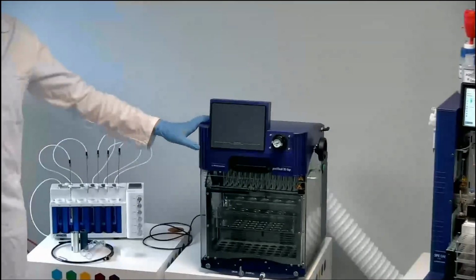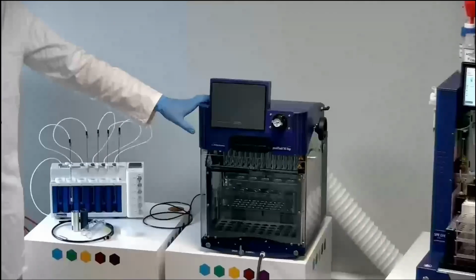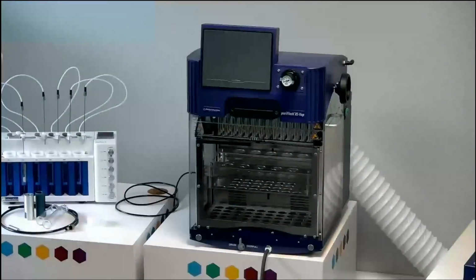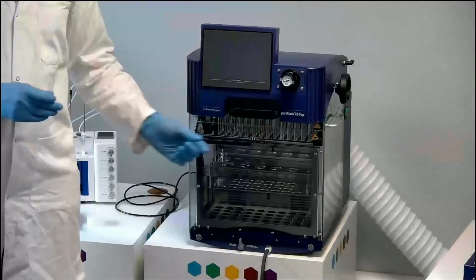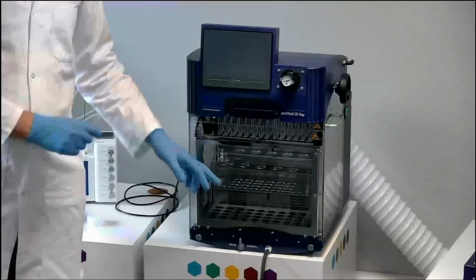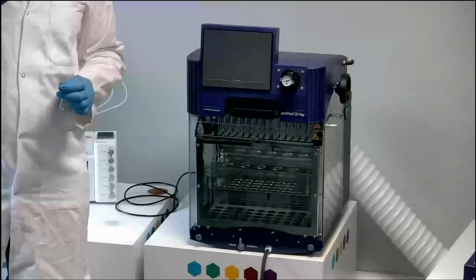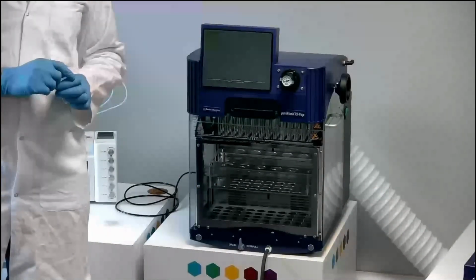Here you have an evaporator, it's a gas blowdown. So we have a vortex of nitrogen or compressed air to evaporate the solvent inside the tube. You just open the lid, you put your tube inside, you heat the bath, and you inject nitrogen or compressed air, and you control the gas.